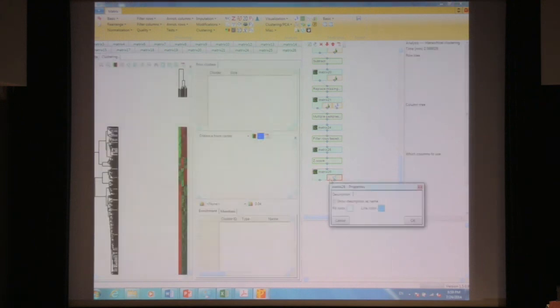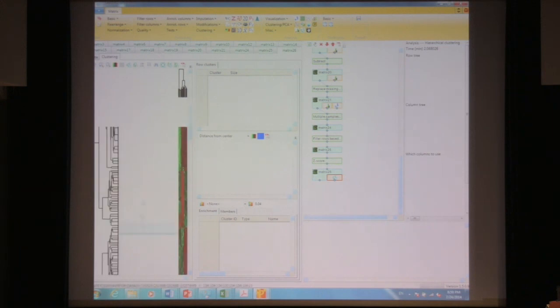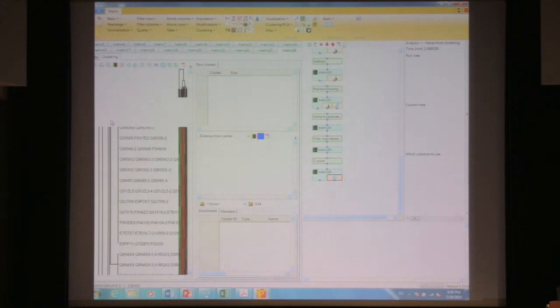Okay, this is probably not finished on your computers, but in the interest of time, I'm just going to show you very quickly some ways to navigate the data in here. The white space here is not actually white space, but it's where all the genes, or in this case sites, could be displayed. So we can zoom in, and you can see here in this case the UniProt identifiers are shown.